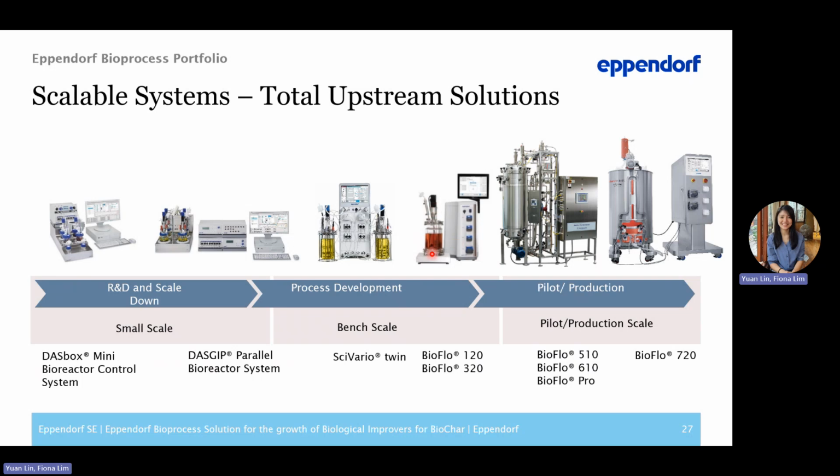Within one run you can only run 1 bioreactor at one time. So that is the good thing about the DASbox.